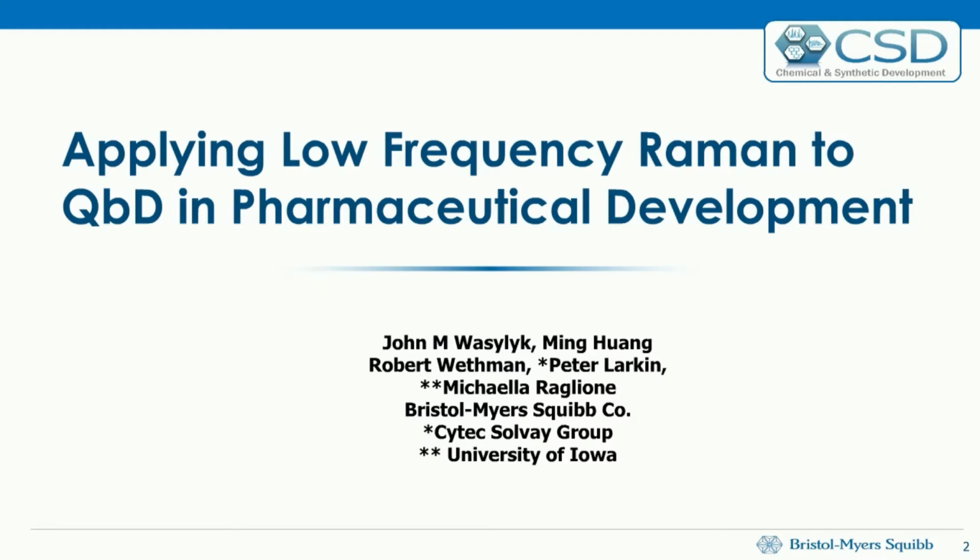Today's discussion or presentation will focus on low-frequency Raman and how it's applied at my company in order to control and understand the crystallization process and ultimately make good final active pharmaceutical ingredients, or API as we refer to it.